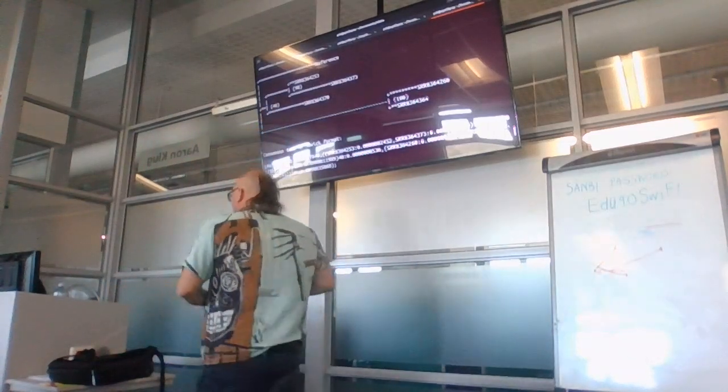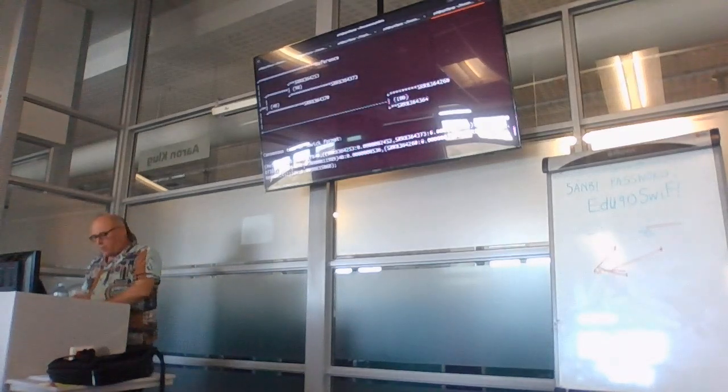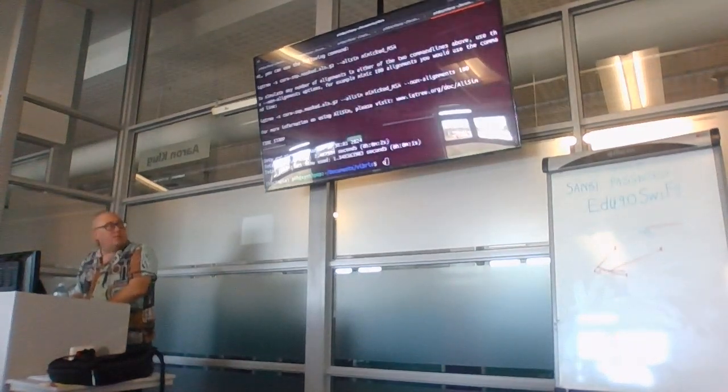Okay? So now we can take the IQ-TREE file. I want to see if this works if I do it with Microreact. Probably not, but let's just see. Let me see if I've got a mouse. Where's my mouse going? Okay.